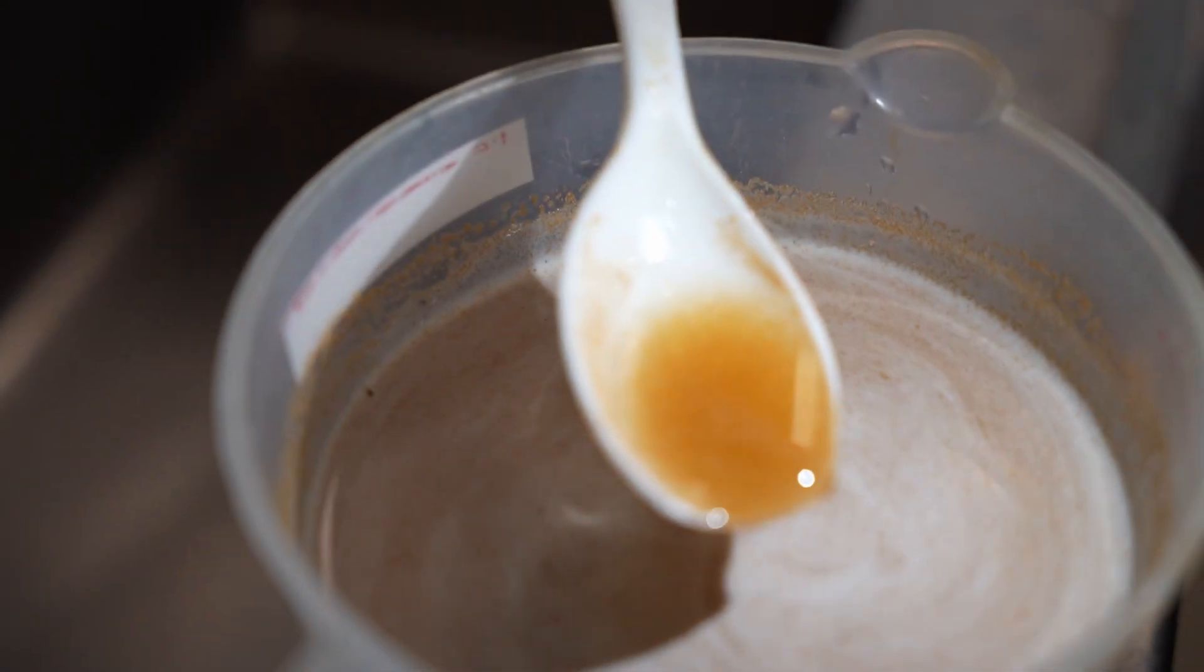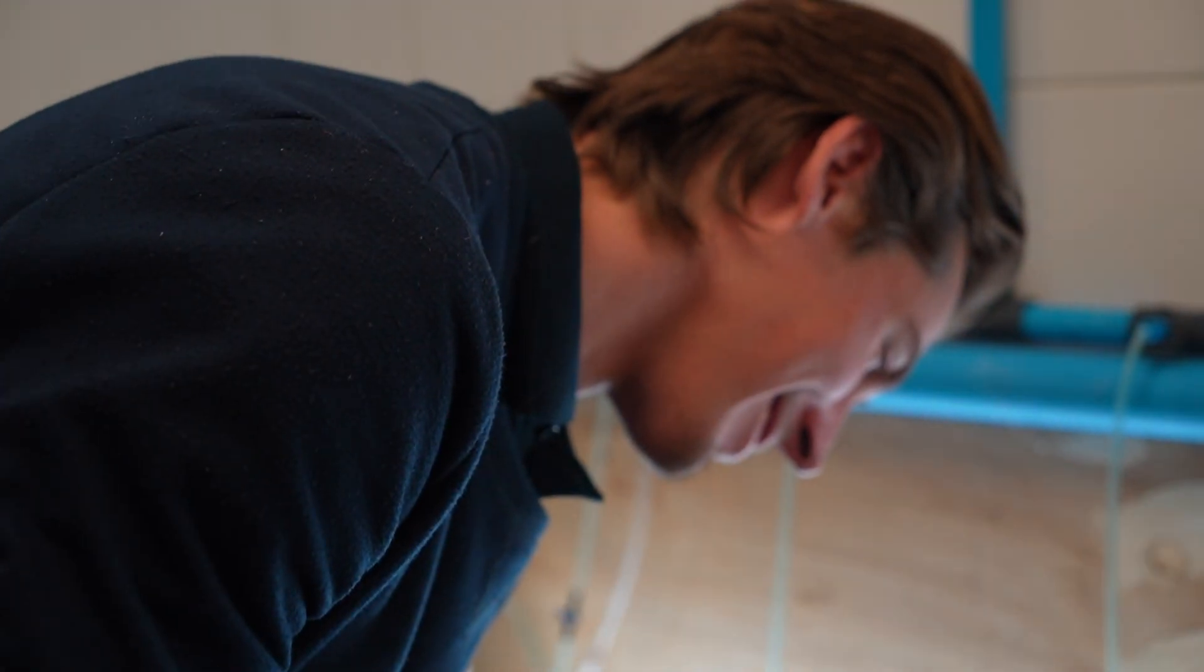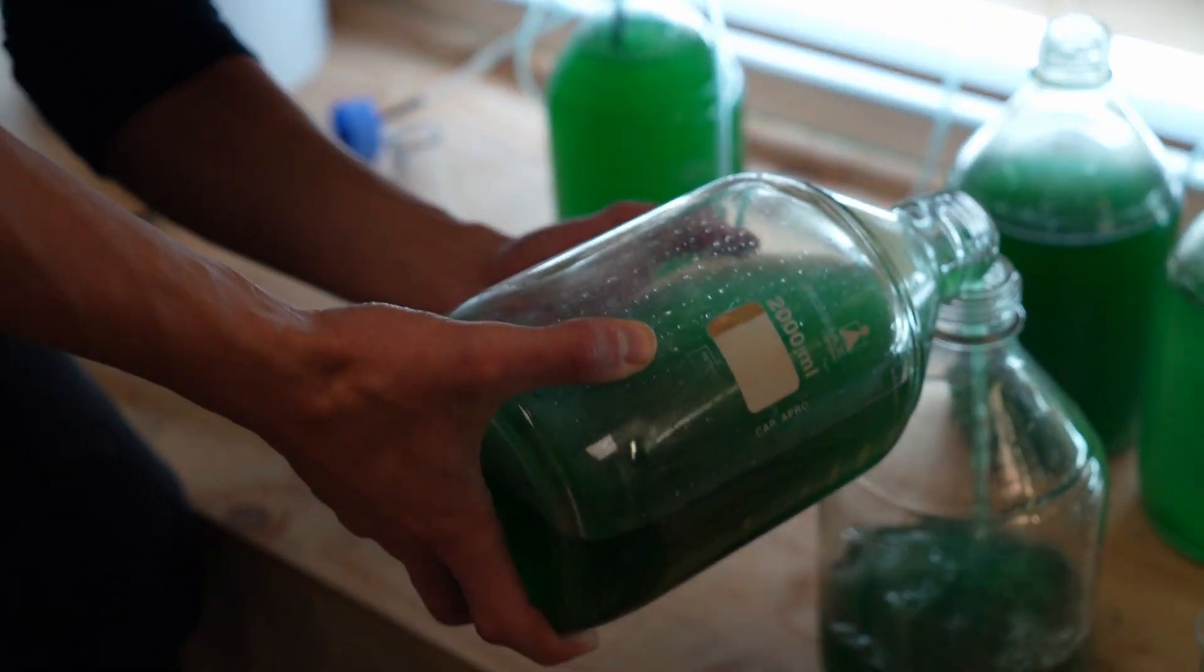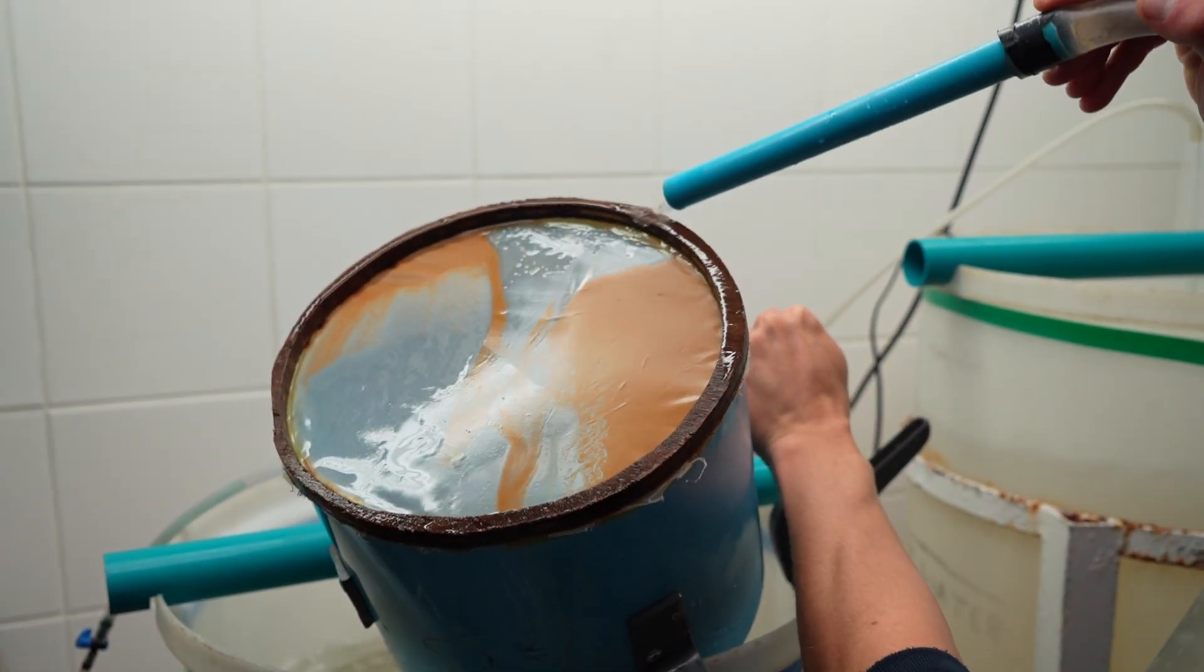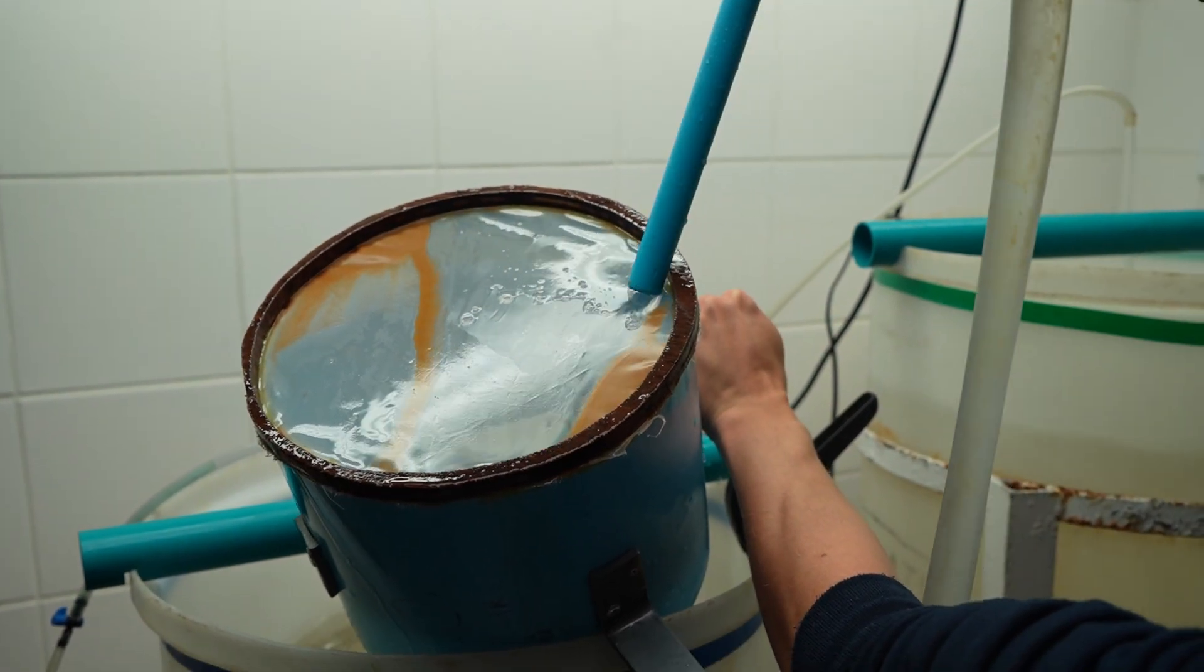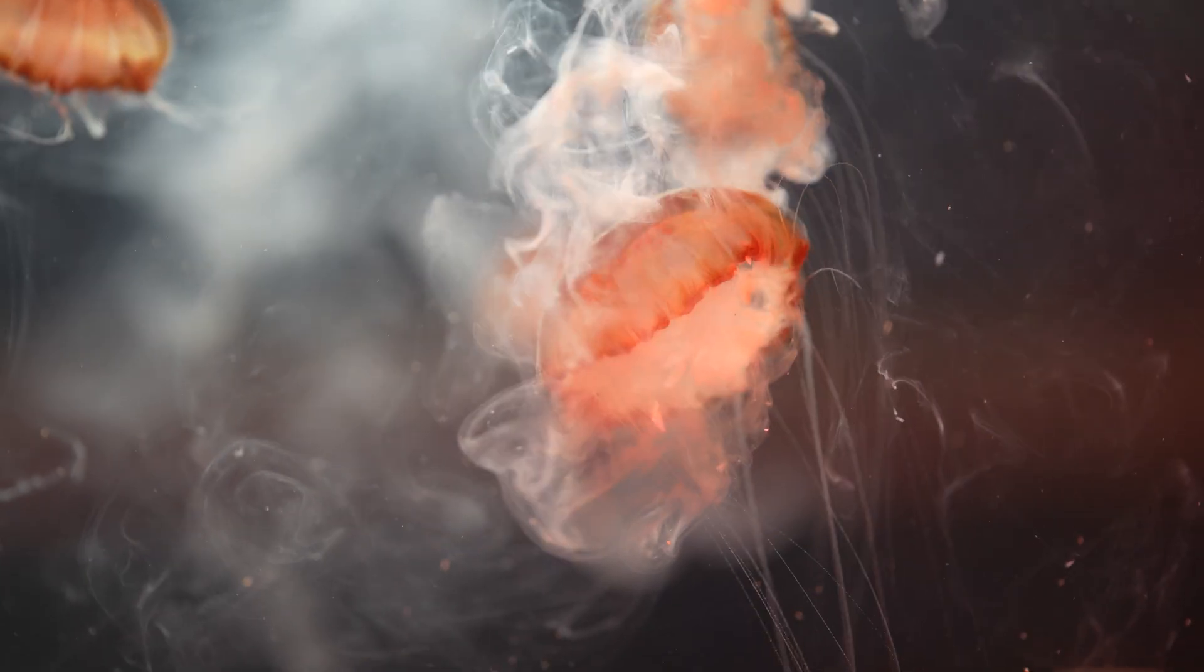What the culture lab is and what we do here is essentially we culture different organisms, and what that means is we maintain standing populations of these animals. That includes basically growing them, keeping them, feeding them, and then using them as a food source. The ultimate goal of the culture lab is to culture and grow little organisms as a food source for our animals in the aquarium.